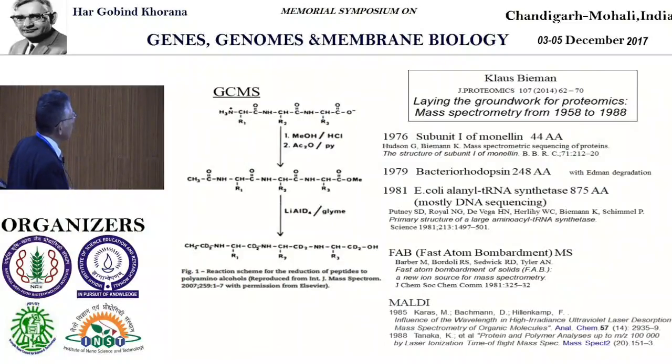But then in 1981, fast atom bombardment MS came out, so GCMS was no longer used. These days, we use MALDI, matrix-assisted laser desorption ionization, for protein sequencing.